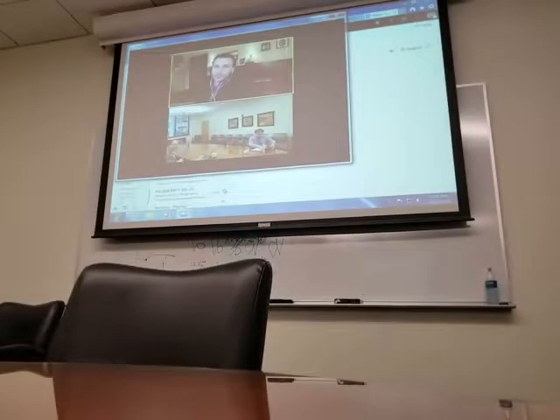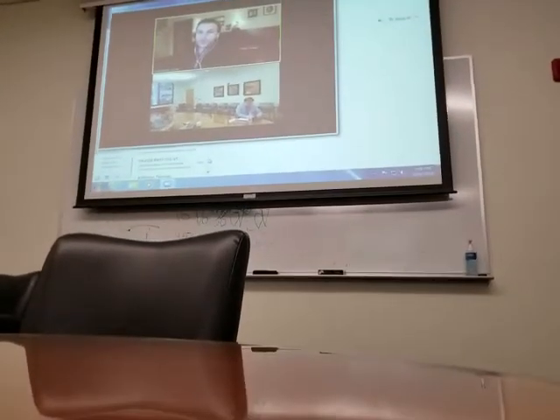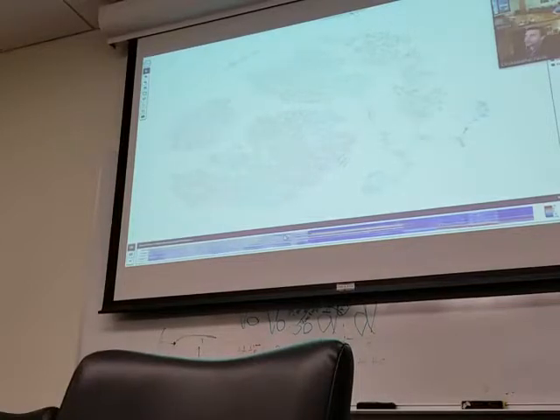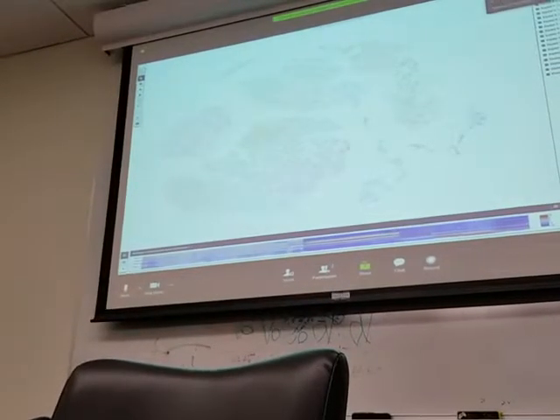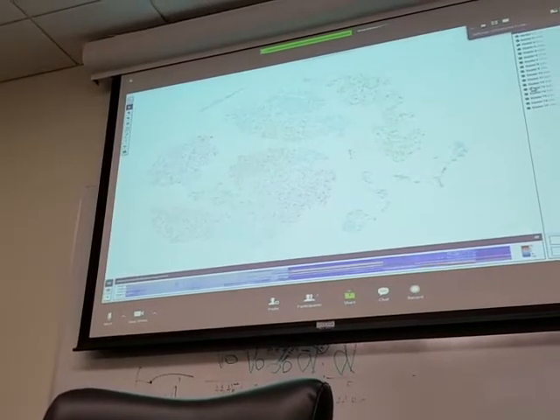All the samples together, but maintaining what those IDs are across those samples for the cells in question. So just kind of pulling up the Cell Loupe browser. This is the aggregate of all the samples, just shown in the Cell Loupe browser because it's easy to show initially. And this is on the Box folder that I shared with Banga already. And I can share it with the rest of everybody too.